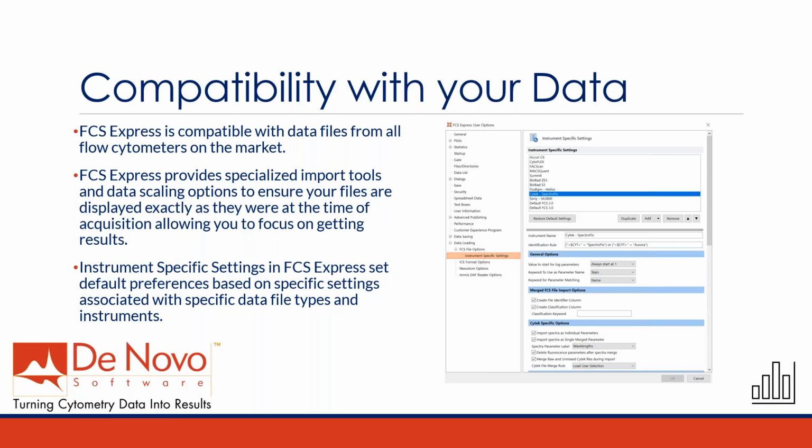One of those tools is called our instrument specific settings. You can set default settings for a specific instrument. So when you bring it into FCS Express, it's going to look just like it did for acquisition. You can just keep going with that data analysis and not get stuck having to worry about making all of these adjustments as you go.